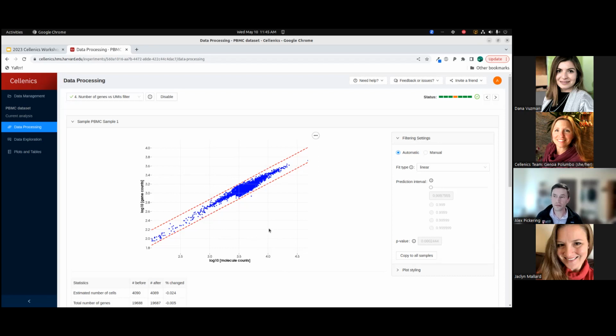And this is one filter where, if you do see a substantial number of cells outside of these red threshold lines, it's worthwhile investigating exactly what those cells are, and then determining at that point whether or not it's appropriate to filter them out. The most common scenario that you'll see, and you'll see this today, is a group of cells down here.